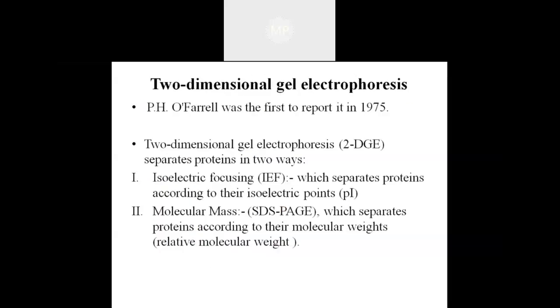Now moving to the next slide. Now I'm explaining two-dimensional gel electrophoresis. In 1975, O'Farrell was the first to report 2D gel electrophoresis. In this technique, the separation of proteins is mainly based on two factors.